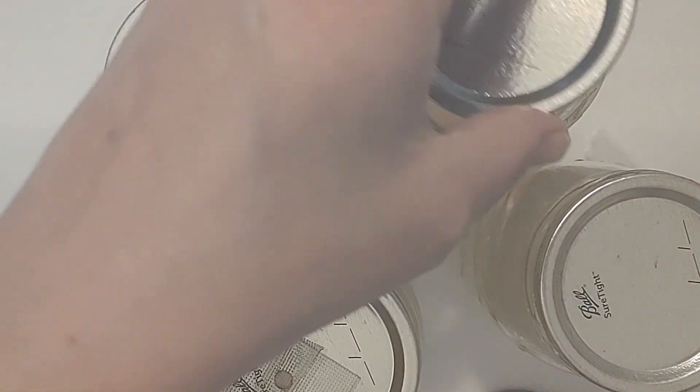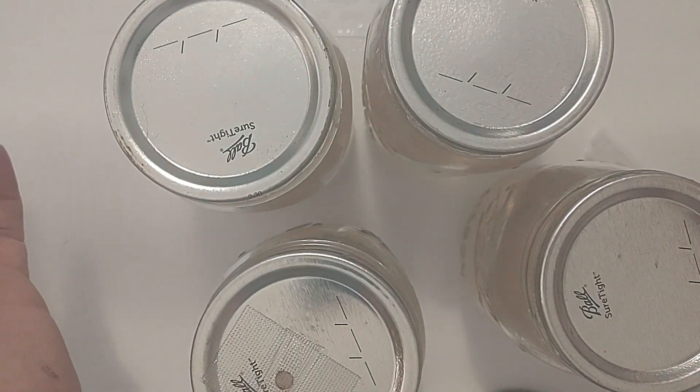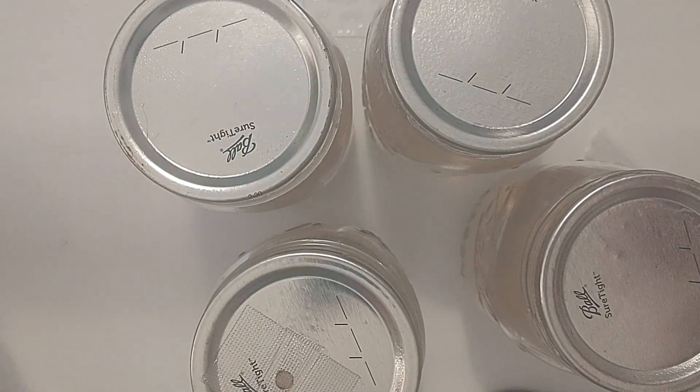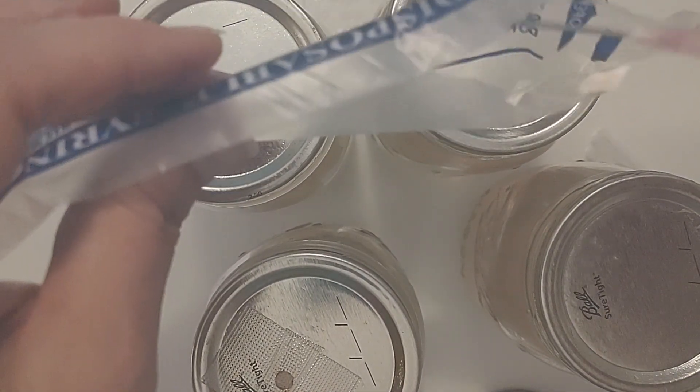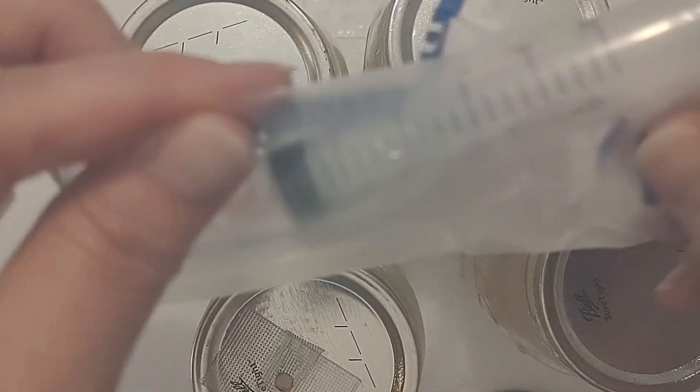I didn't touch the syringe to anything. It went in, it came out, and now I'm going to be tossing this syringe. I'm done with it.